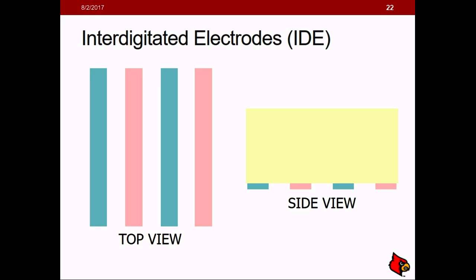Well, of course, that's right there on the electrode edges. So if that's where the greatest dielectrophoretic force is, now we have to take into account the real part of the Clausius-Mossotti factor and whether it is attractive or repulsive.